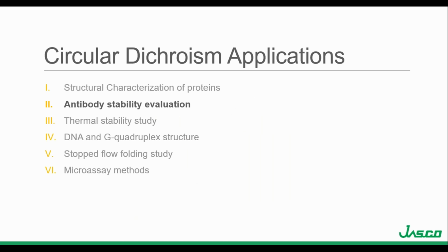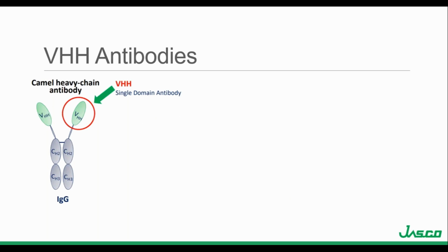So now I'm going to go over an antibody stability evaluation. Antibodies are more and more attractive for drug therapy because they do little damage to the body since they're proteins and can be used for various drug targets.